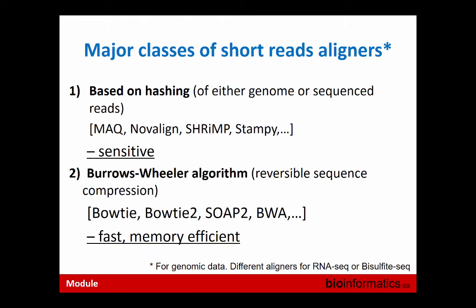So now we have a genome, we have our FASTQ file, and we would like to do alignment. There are many aligners, and of course, alignment was known before next generation sequencing data appeared. Alignment was developed before, but the whole area was open for computer scientists who would like to develop fast aligners for short reads. Typically, they use all kinds of heuristics, so it's not an exact match. And we don't actually want our alignment to be an exact match.